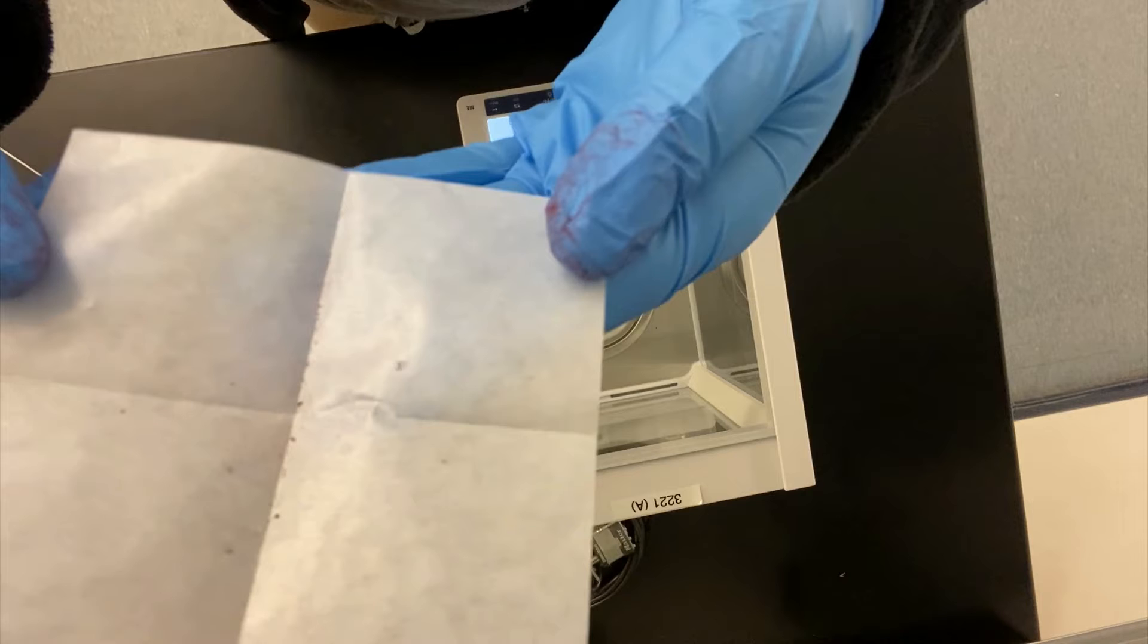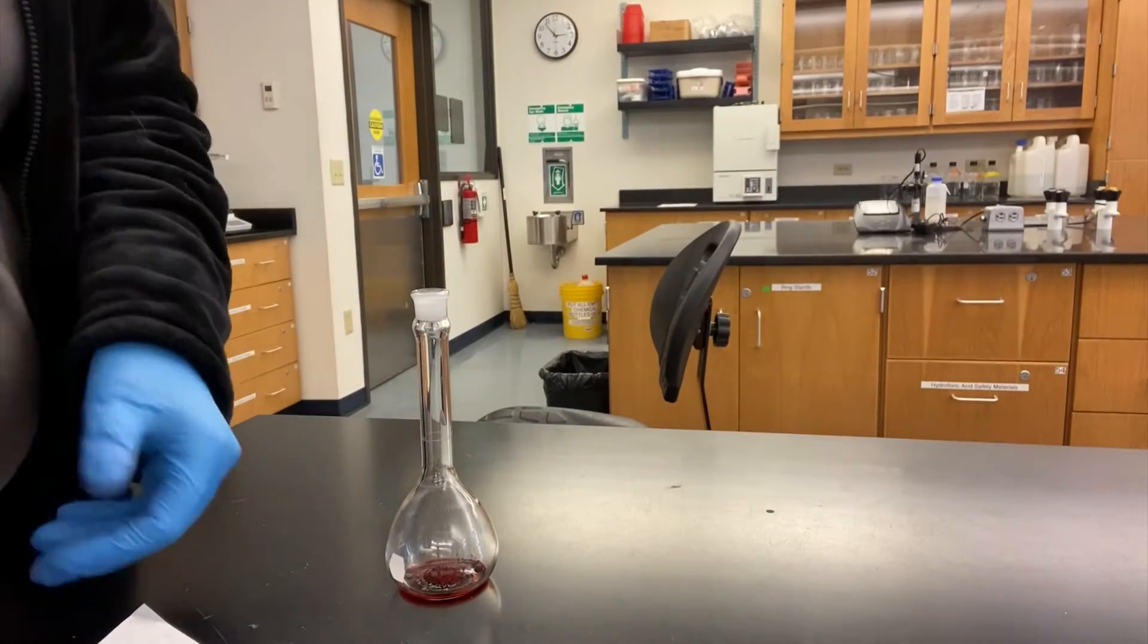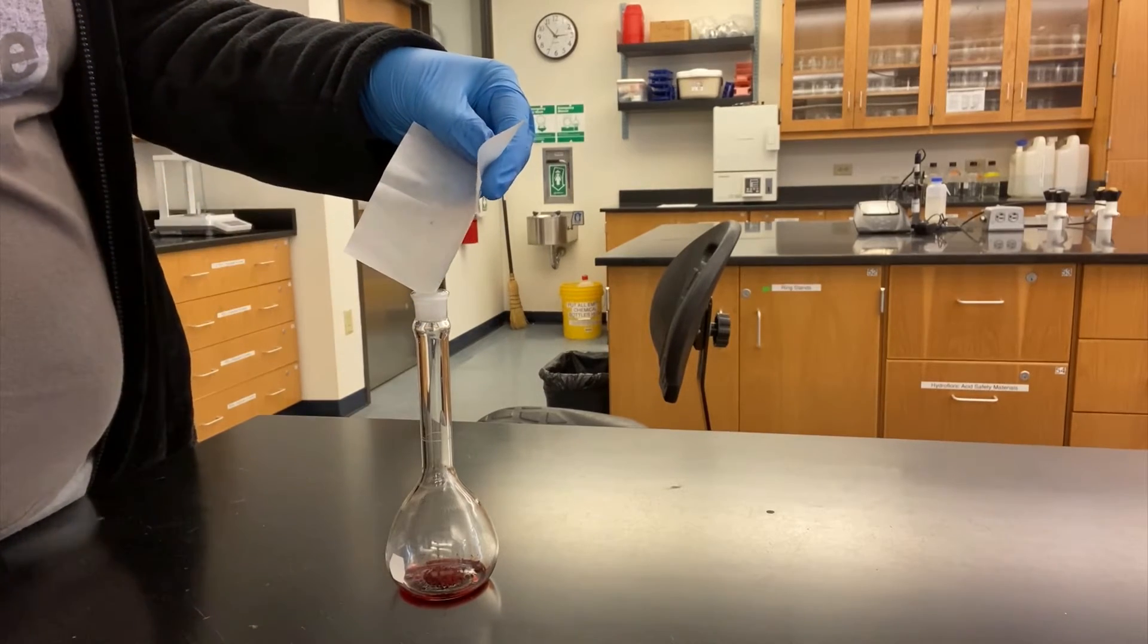The point of quantitative transfer in this case is to make sure that every single bit of the dye that I weighed ends up in my volumetric flask. I weighed out 0.3064 grams and I want all of it in the flask, not 0.3063 grams, not 0.3062, but all of the 0.3064 grams. So what I'm going to do is rinse the residue on the filter paper into the volumetric flask with deionized water.